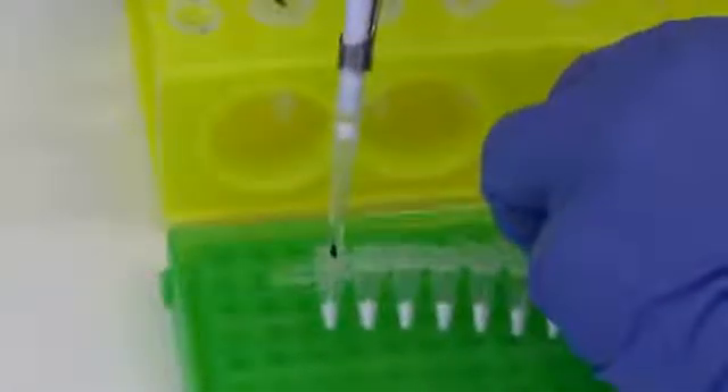Add 47.5 microliters of your first reaction and mix with the first freeze-dried reaction. Pipette to mix. Repeat for your remaining reactions and positive controls.